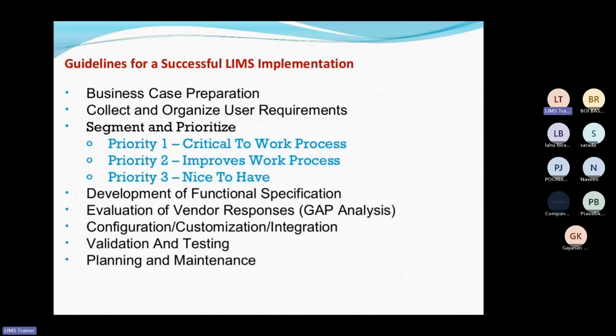Do you have any questions here about LIMS implementation? Am I audible? Yes, go ahead. Are you going to explain the complete validation life cycle of LIMS, starting from the URS? Yes, that will be there. Whatever the syllabus is, I am going to explain here. After one or two slides, I will explain what is involved in that particular course, the detailed course.